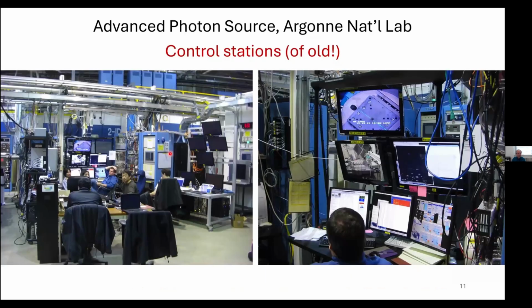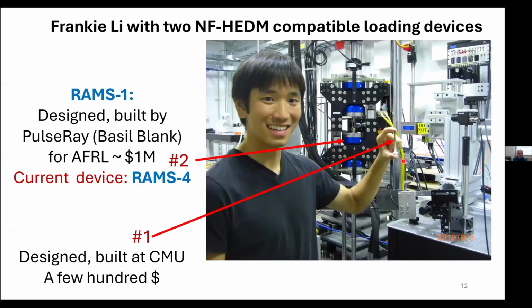So, okay, lots of computers, lots of screens to look at, just visual cameras to look inside the hutch, like up here, and to look at and analyze the diffraction images. That's a near field measurement right there. You can see the diffraction spots.